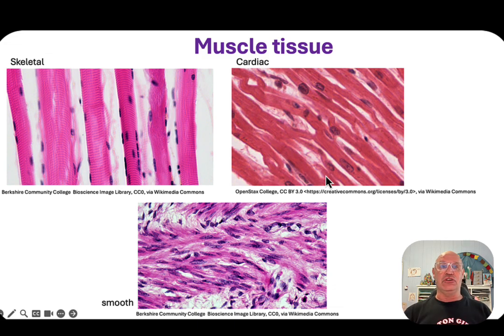With muscle tissue, skeletal muscle, you see that it's striated or has stripes. That's the contractile elements, and then you can see the cell body, and then you can see the nucleus, and sometimes you can see the mitochondria as well. Yeah, so they're striated. Now, with cardiac muscle, we can see that it actually has sort of branches to it. So you can see two branches coming off here, and then we have the smooth muscle, and you can see the mitochondria here because it's highly energetic.